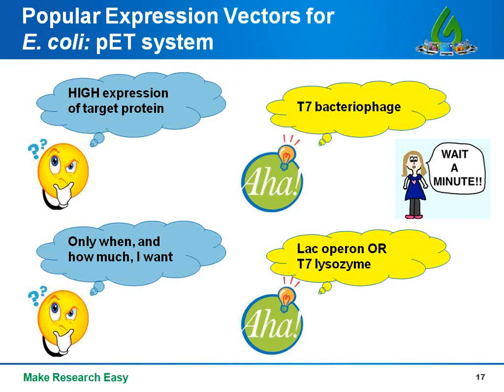There are special expression vectors that are recommended for use with toxic proteins, which are designed to prevent leaks of target protein expression in the absence of IPTG induction. So pET vectors are the most popular vectors for expression in E. coli, although there are other options for E.